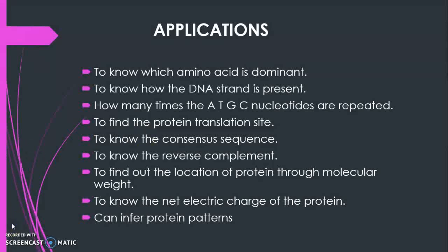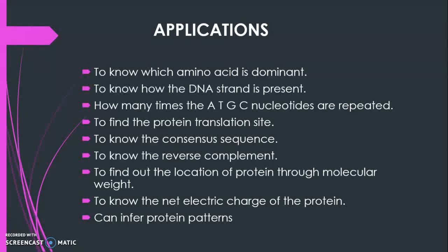Using protein pairwise alignment, the consensus sequence can be found. Reverse complement of a DNA sequence can also be found. Using the molecular weight, the location of protein can be inferred.